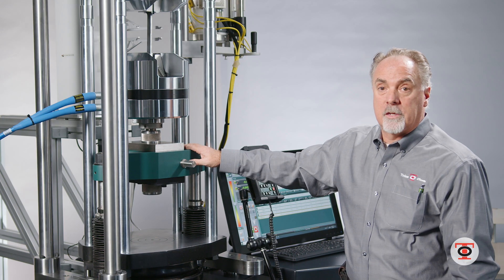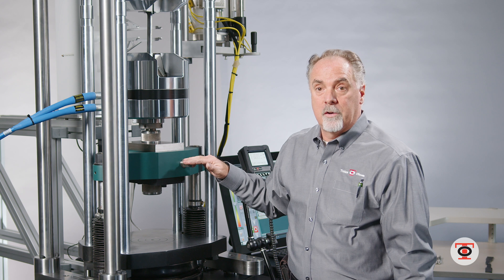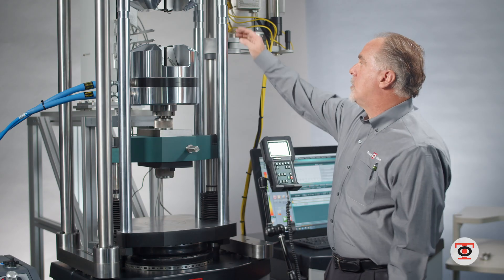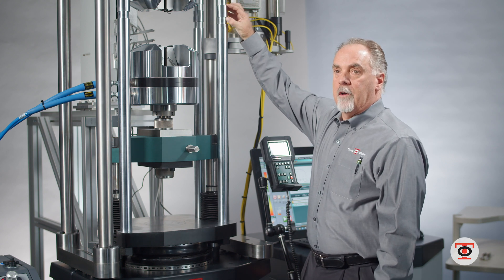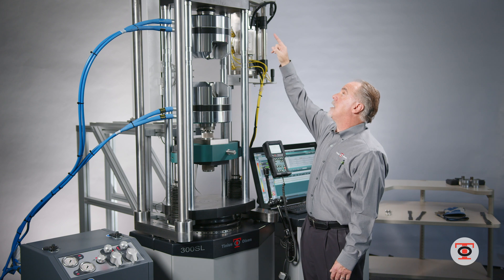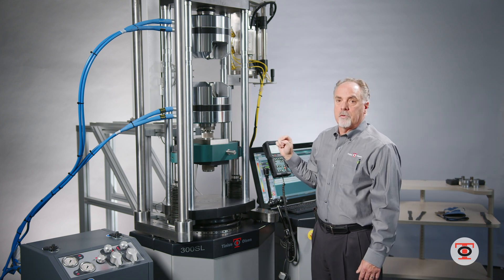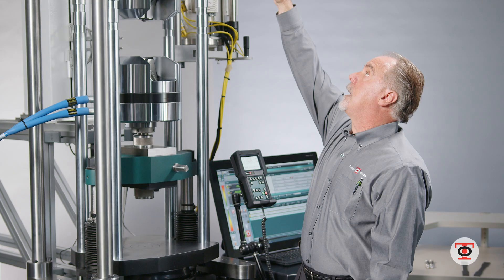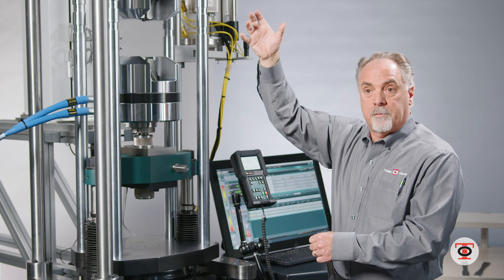This does have an adjustable crosshead that I can move up and down based on how much tooling I have in here. This would be a standard height of a standard 300 SL. This machine has three-foot adjustable height, so you could have the upper crosshead mounted here and two more positions up for longer specimens.